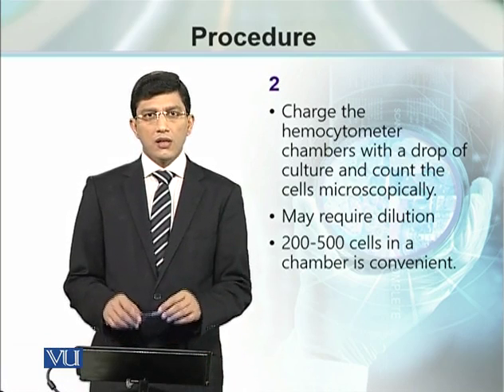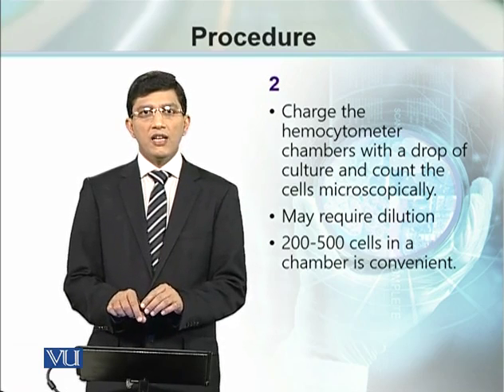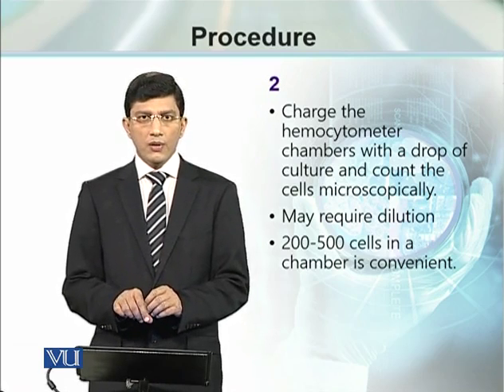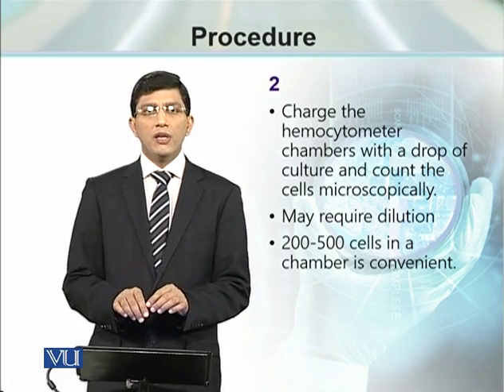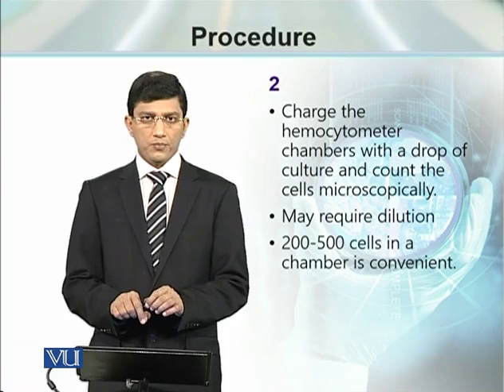This culture sample can be used to charge the hemocytometer. Hemocytometer will be the source for cell counting.